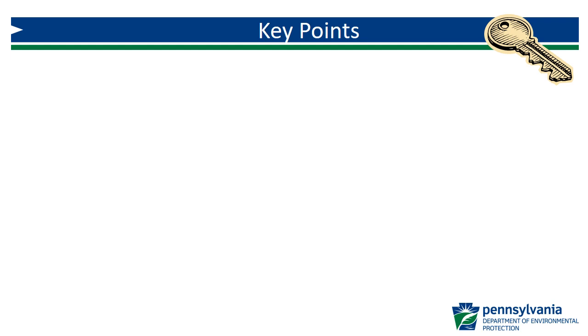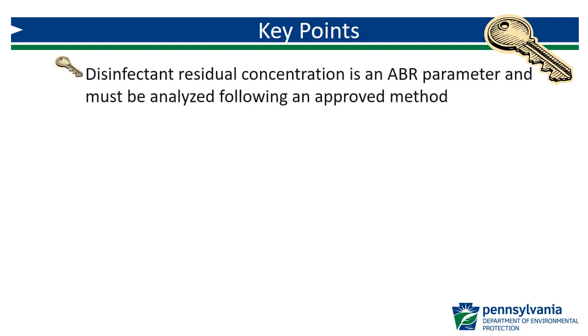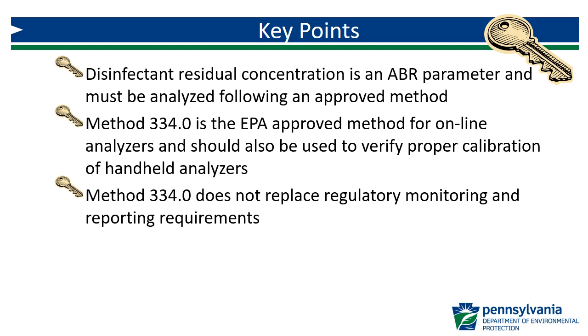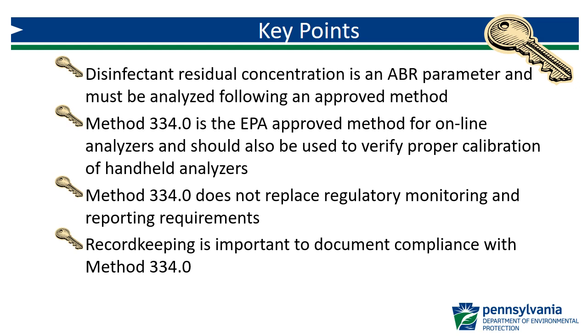In summary, let's review the key points from this video. Disinfectant residual concentration is an accreditation by rule parameter and must be analyzed following an approved method. Method 334.0 is the EPA-approved method for online analyzers and should also be used to verify proper calibration of handheld analyzers. Method 334.0 does not replace regulatory monitoring and reporting requirements. Record keeping is important to document compliance with Method 334.0.